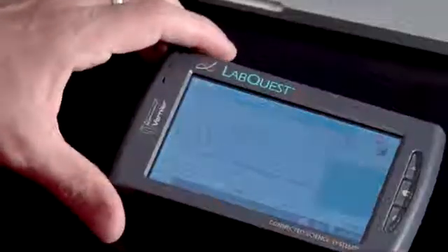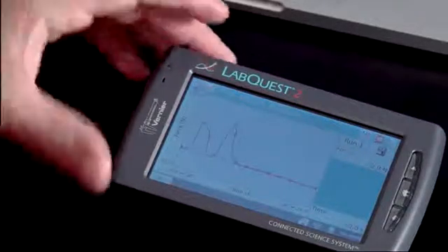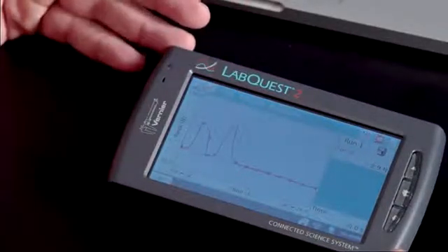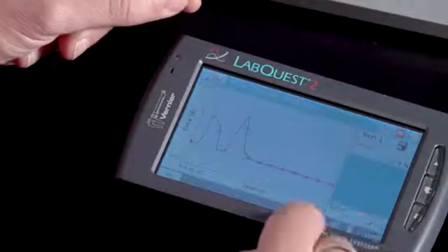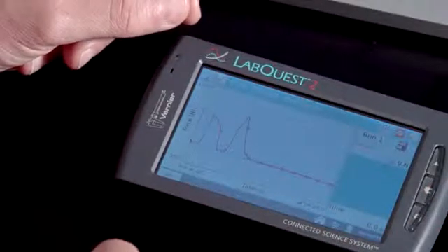Like I said, I'm a biologist. It's not that hard. I can do it. So most of you, once again, are probably familiar with this screen. This is LabQuest app. All I'm going to do is go back to my Connections folder, which has all of my network settings. To get there, I just need to tap on the Home icon or the Home button. So I'm going to tap right here on the Home icon.